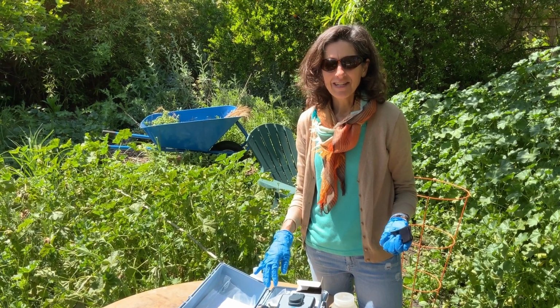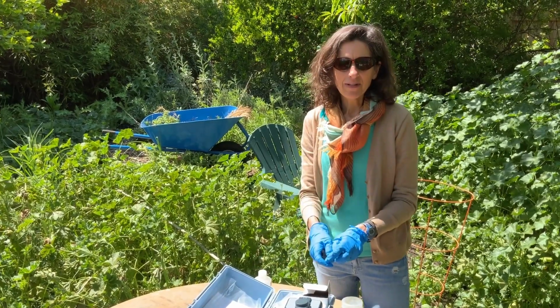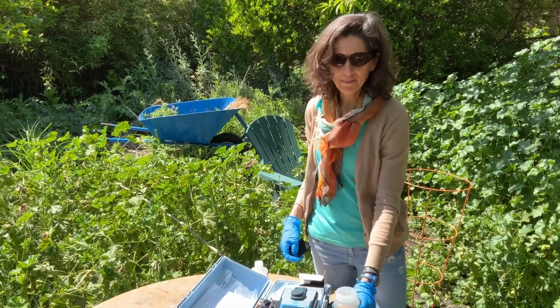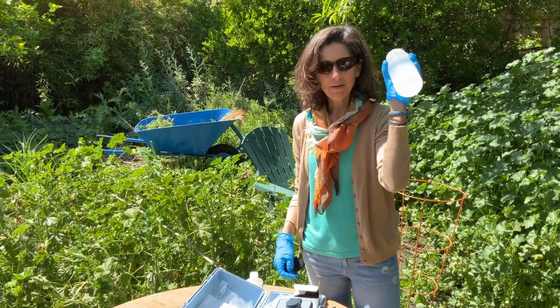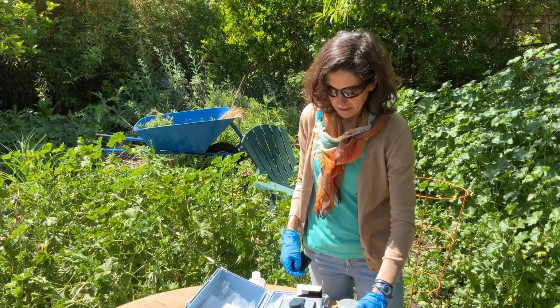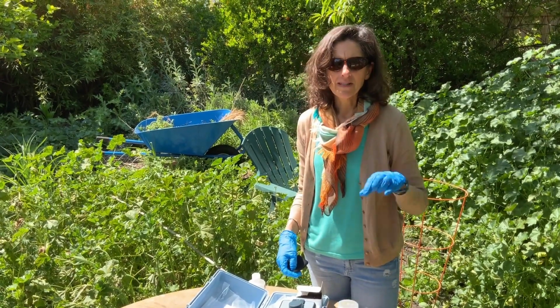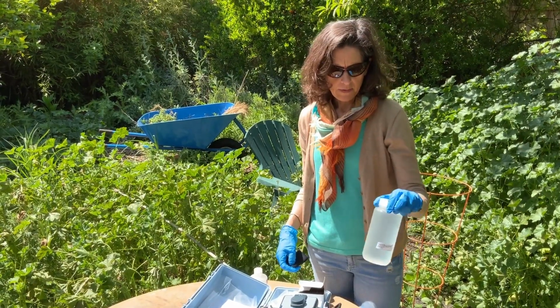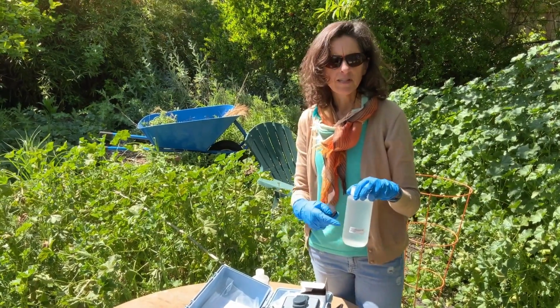Hello, it's Dr. Ishikawa again, and I am going to show you how to measure turbidity today. So we collected some samples at Poudre Creek. So here's our Poudre Creek sample, and we are going to test it for turbidity. Turbidity gives you an idea of how cloudy the water is, or how much stuff is suspended in it.